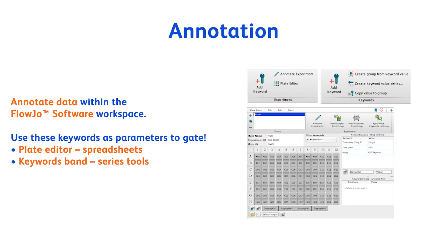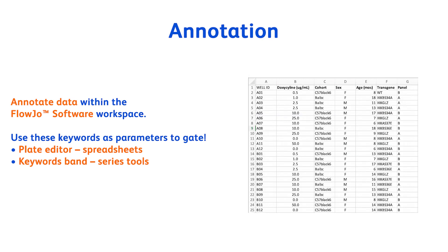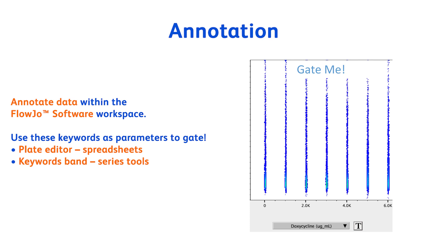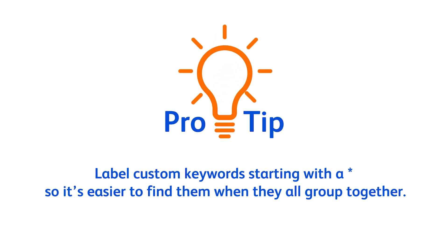Now that our samples are QC'd and compensated, we want to annotate them using keywords. Keywords are metadata within your FCS file that allow the description of each sample — for example, stimulation, tissue, time point, etc. This step is optional, but it results in great efficiency downstream, allowing you to cross-compare different experimental variables rapidly. Pro tip: I like to label my custom keywords starting with a star, so they are easier to find in the keyword list as they all group together.